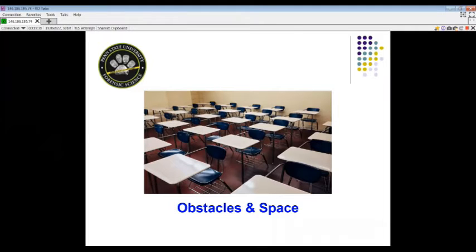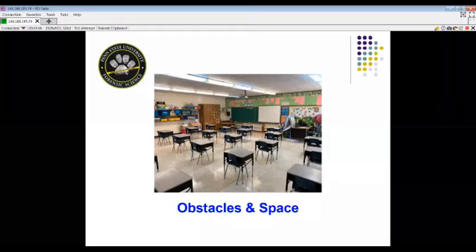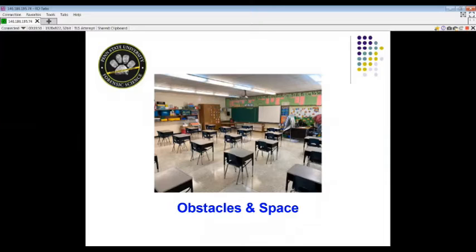So this is a lot of obstacles and very little space, hard for proteins and DNA to move through, versus this space here, which has a lot of room to move around in different directions. This is probably more reflective of what an electrophoretic system looks like, navigating through those spaces and past those obstacles. And then one of the questions is, what's pulling you through the space?